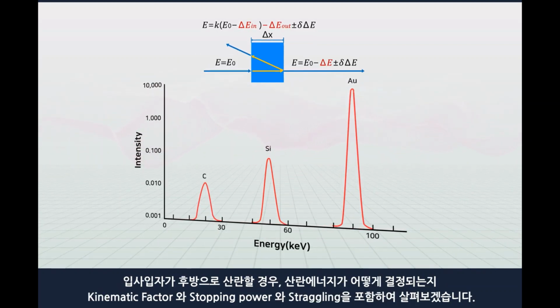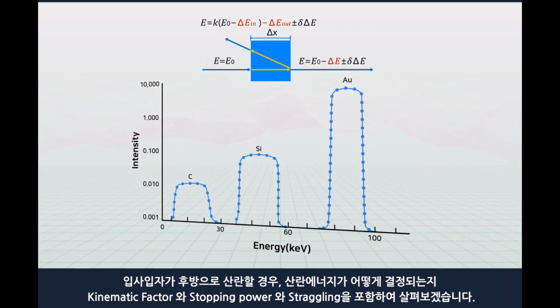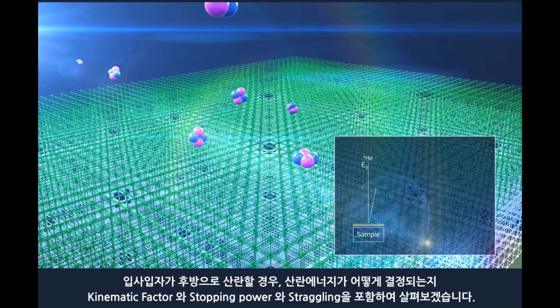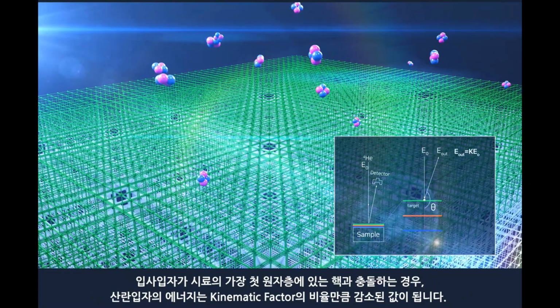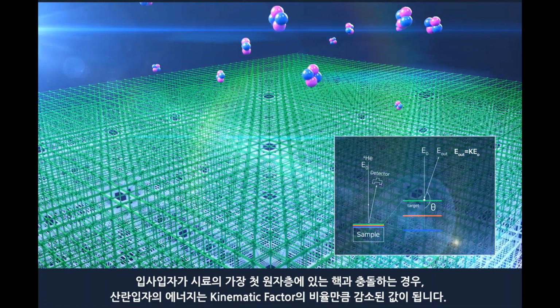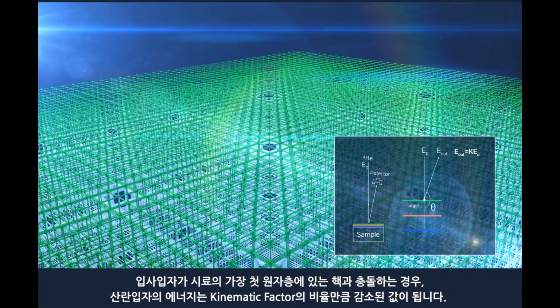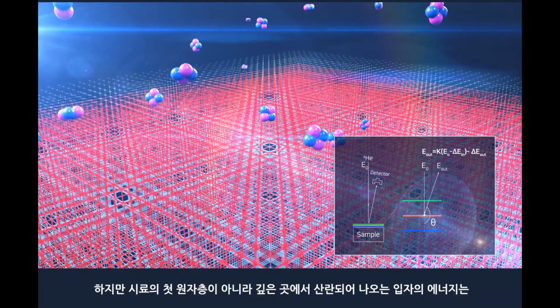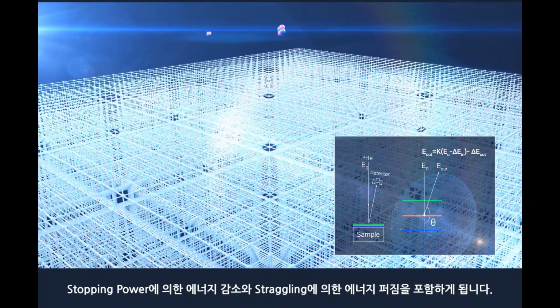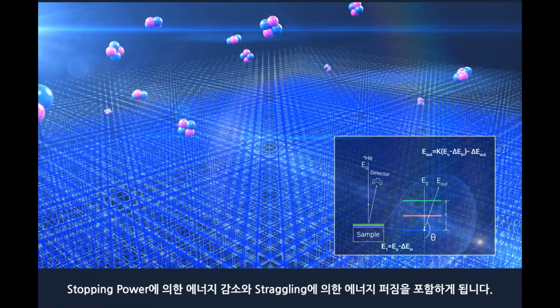Let us observe how the scattering energy is determined when the incident particles scatter backward by considering the kinematic factor, stopping power, and straggling. When the incident particles collide with the nucleus in the surface atomic layer of the sample, the energy of the scattered particles is reduced by the kinematic factor ratio. The energy of the particles scattered from the deep layer rather than from the first atomic layer of the sample includes energy reduction by stopping power and energy dispersion by straggling.